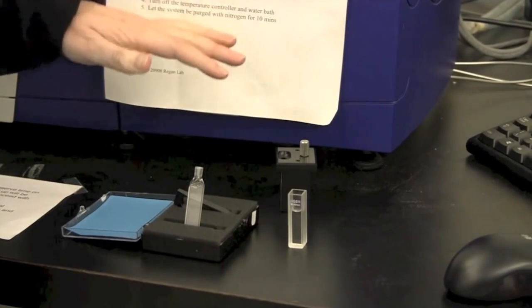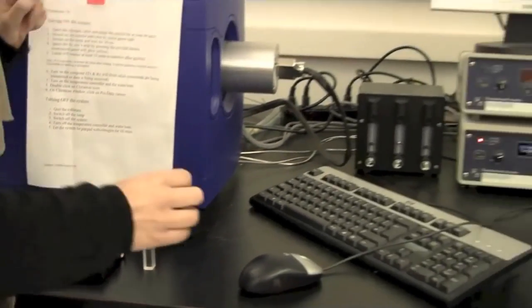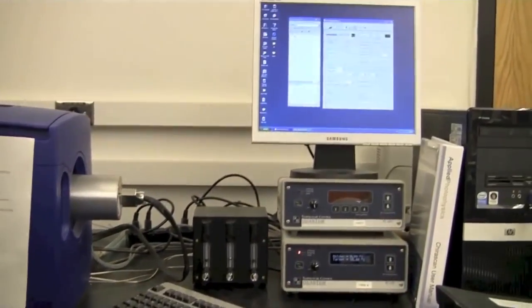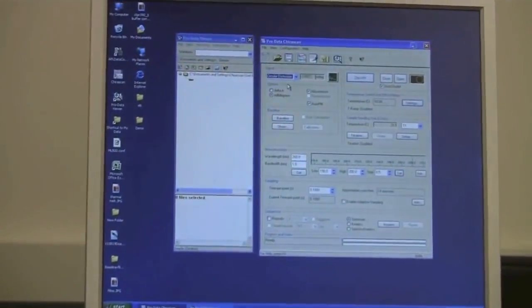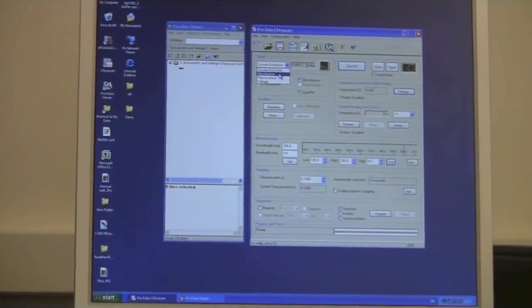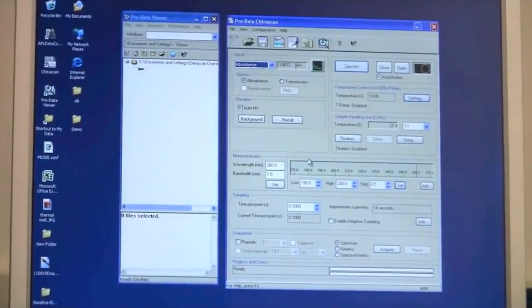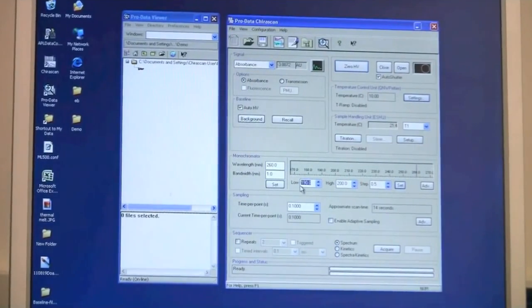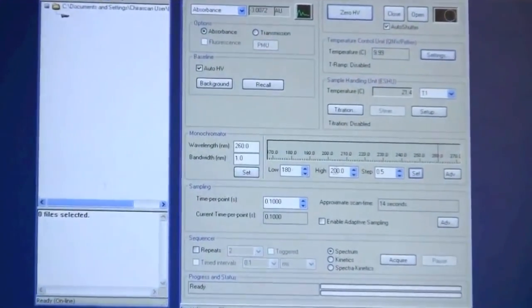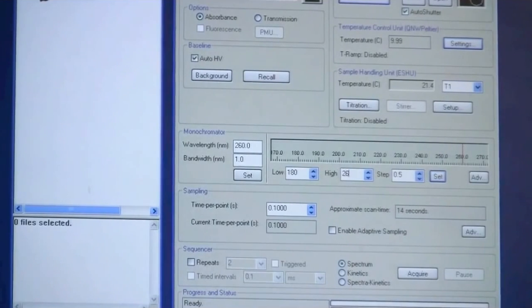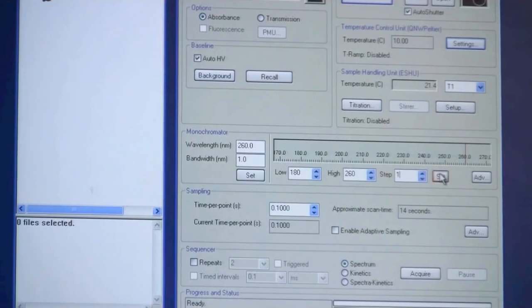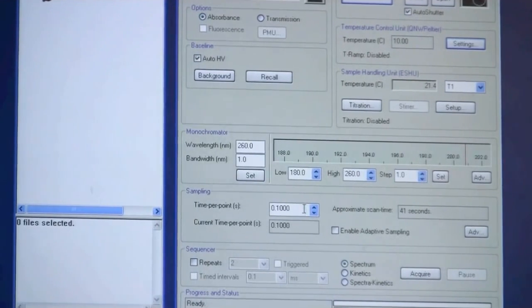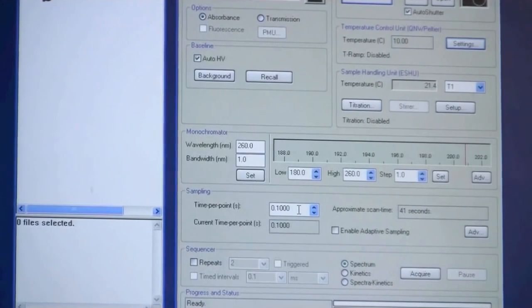The first thing I will do now is to then set up the software. Because we are looking at absorbance and not actually a CD signal I will make sure that I choose absorbance as a signal mode. The wavelength range I will choose down here is from 180 up to 260 which is a typical range for most proteins and I will set the step to 1 nm and I will click set. I will just keep the time per point to 0.1 seconds because that is quick.